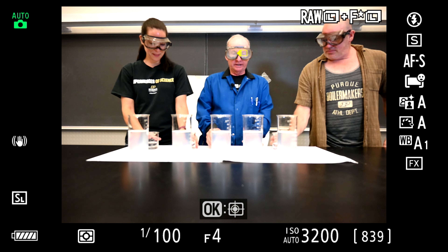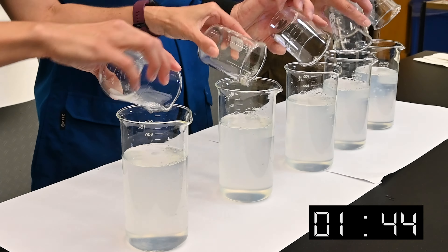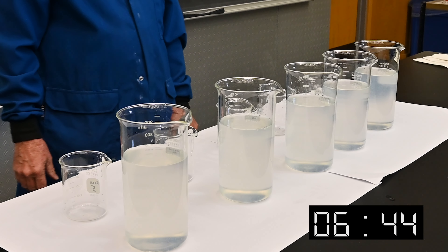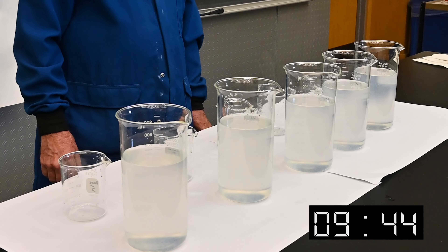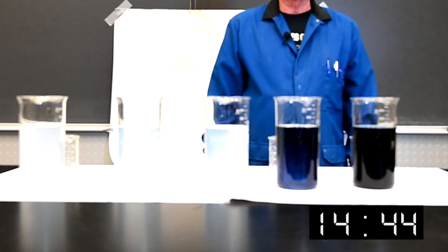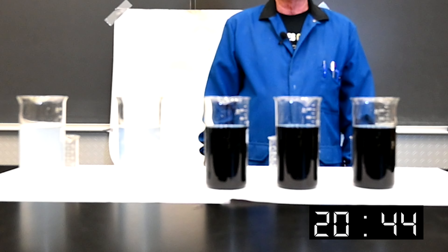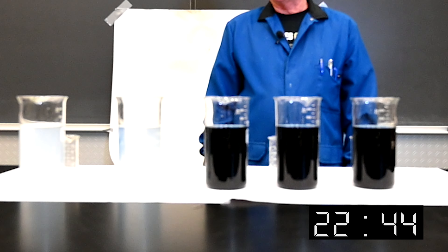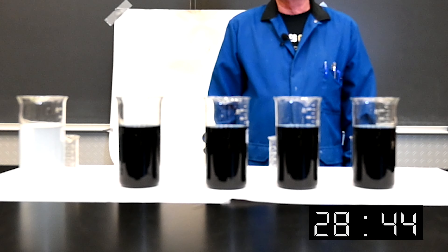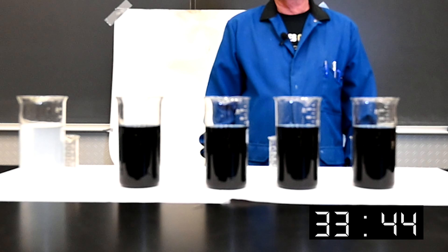Alright, this demonstration is known as the iodine clock. We're again making the blue-black starch triiodide complex, and you see it beginning to take shape there, because of the concentration of the sulfite ion. It affects how long it keeps that complex from staying there, and once it's used up, the complex overdrives the reaction and stays a deep blue-black color.